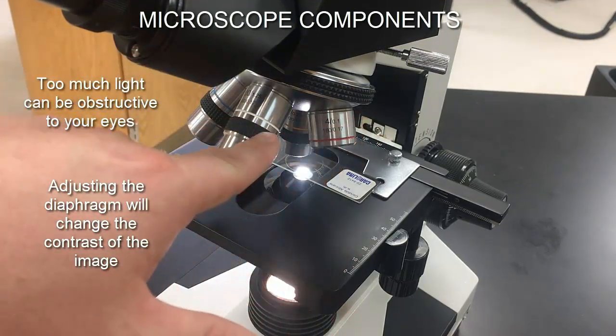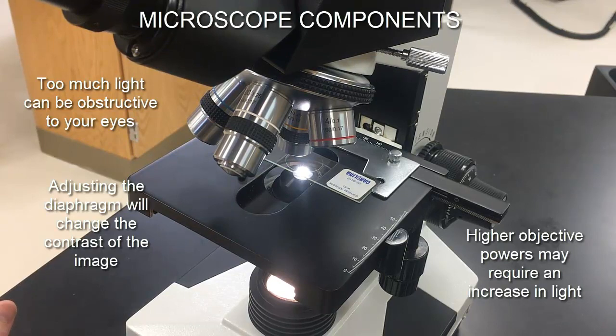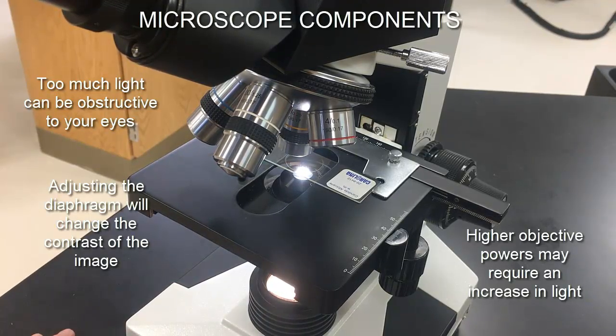As a general rule, the higher the objective power, the more light you'll need, though this isn't set in stone. At lower power objectives you typically need less light; at higher magnifications it tends to constrict light flow into the objective. You can also adjust the iris diaphragm because the contrast of the image changes with light intensity — sometimes you actually see the image differently at high versus low light. The iris diaphragm is one of the most important yet hidden components of the microscope.